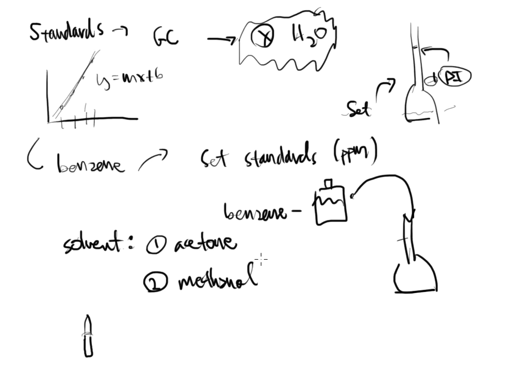And the reason is because both of these are pretty low formula weight compounds. They also have fairly low boiling points, and these do very well of trapping and keeping organics, which is really what we're after and what we're doing in the GC field, right?